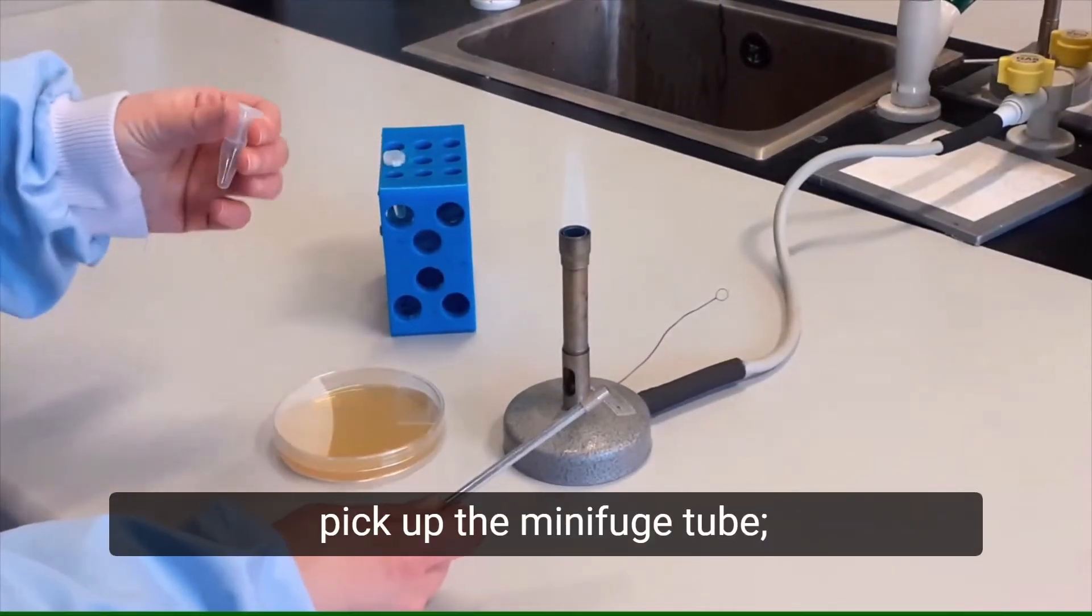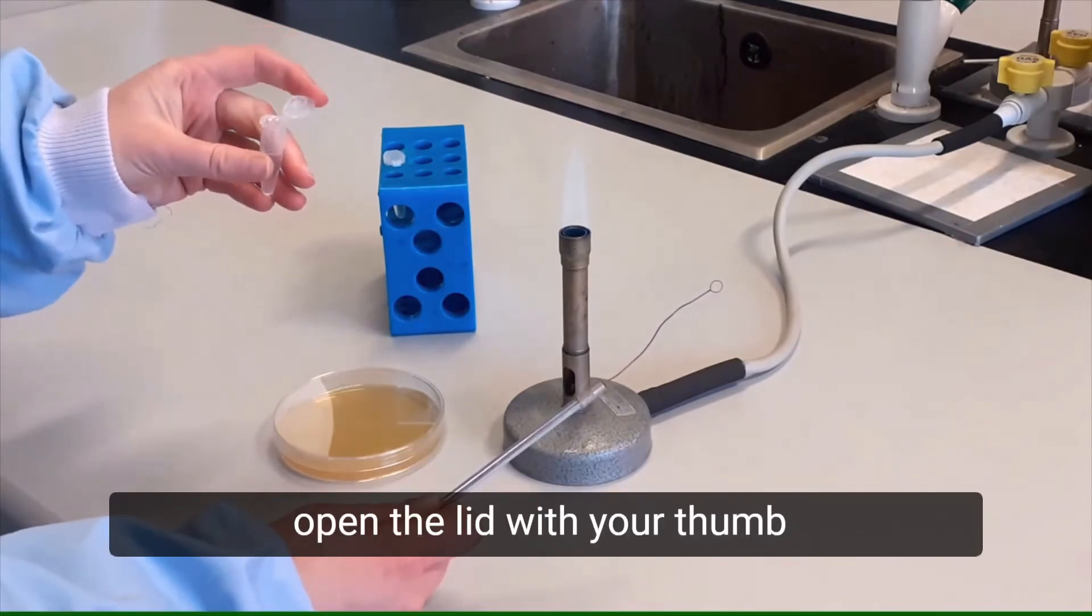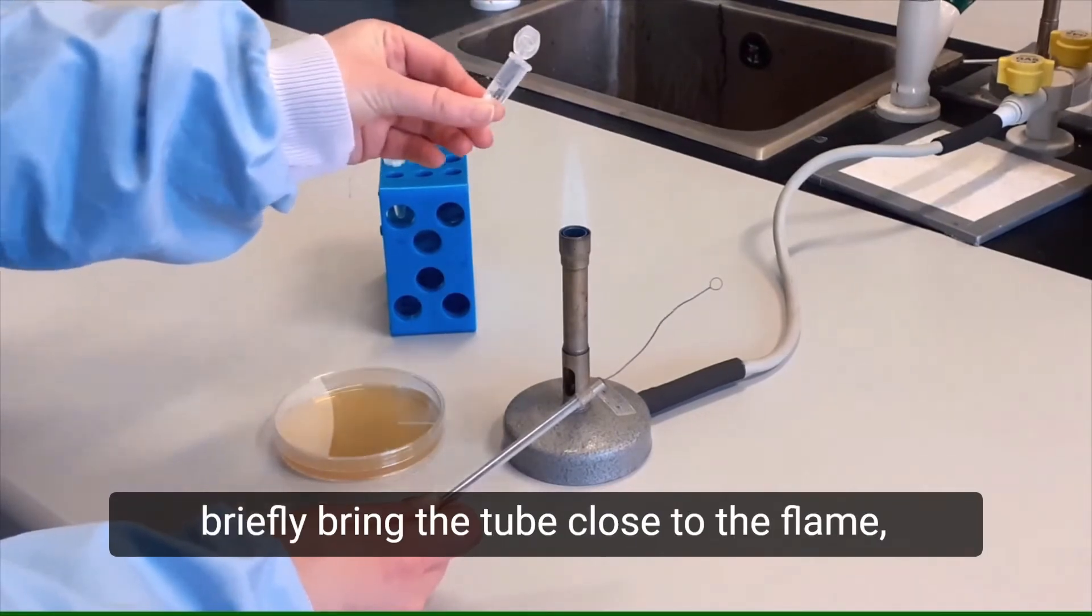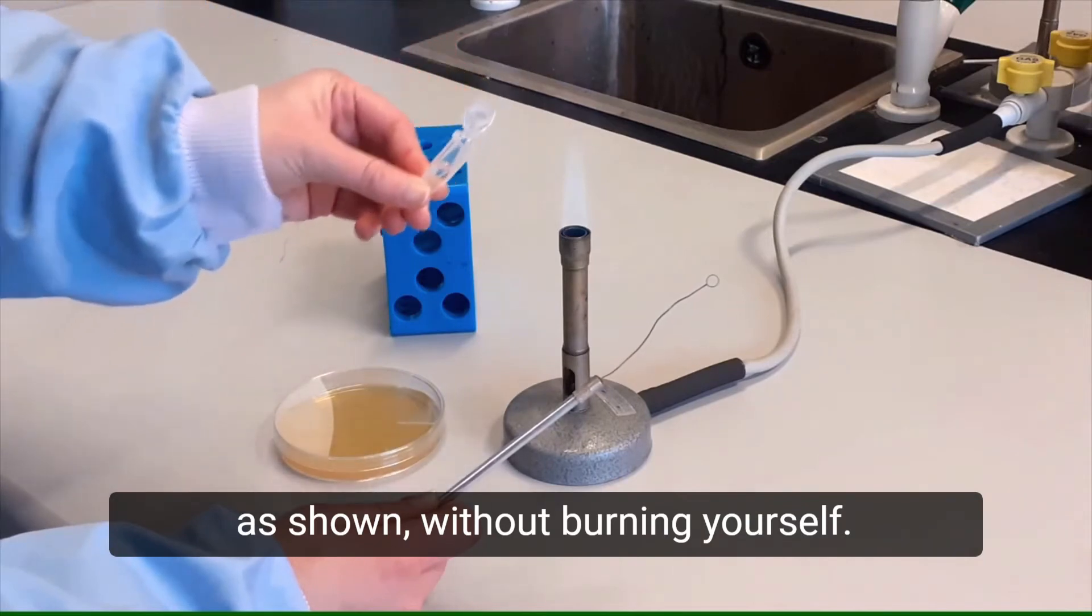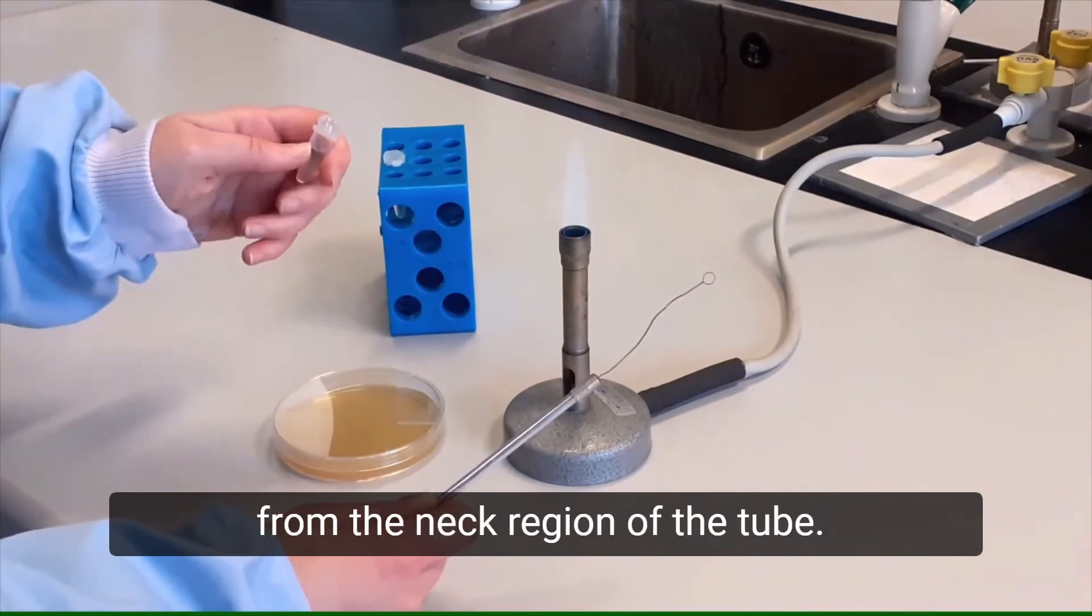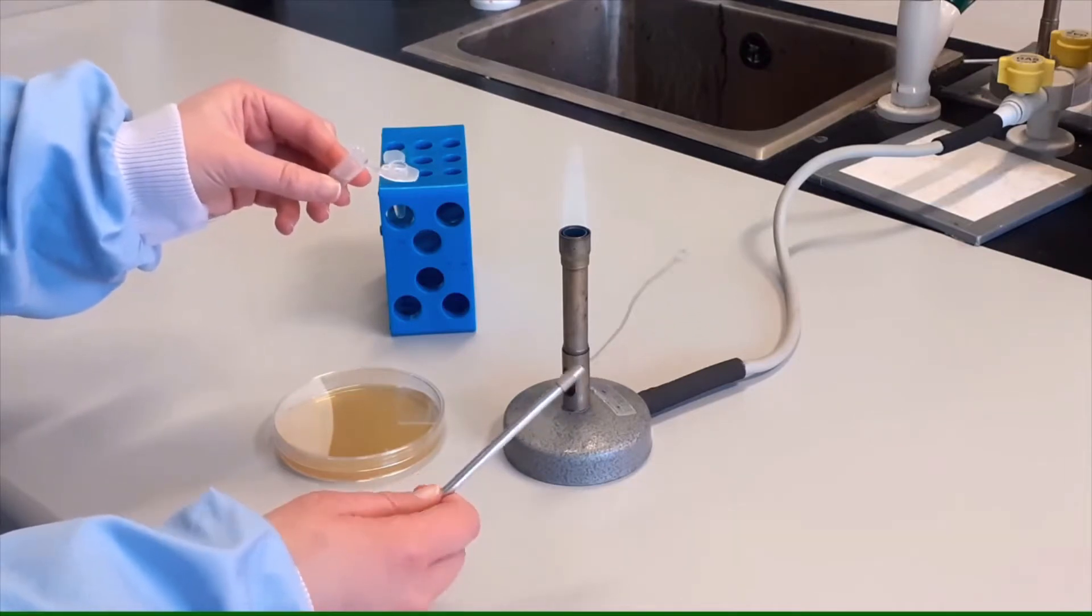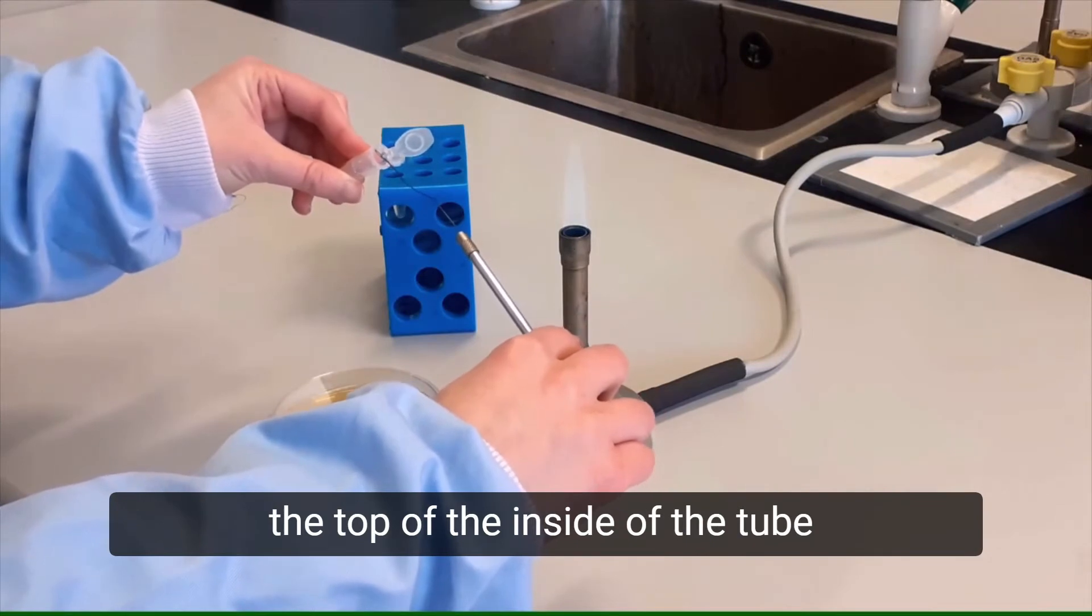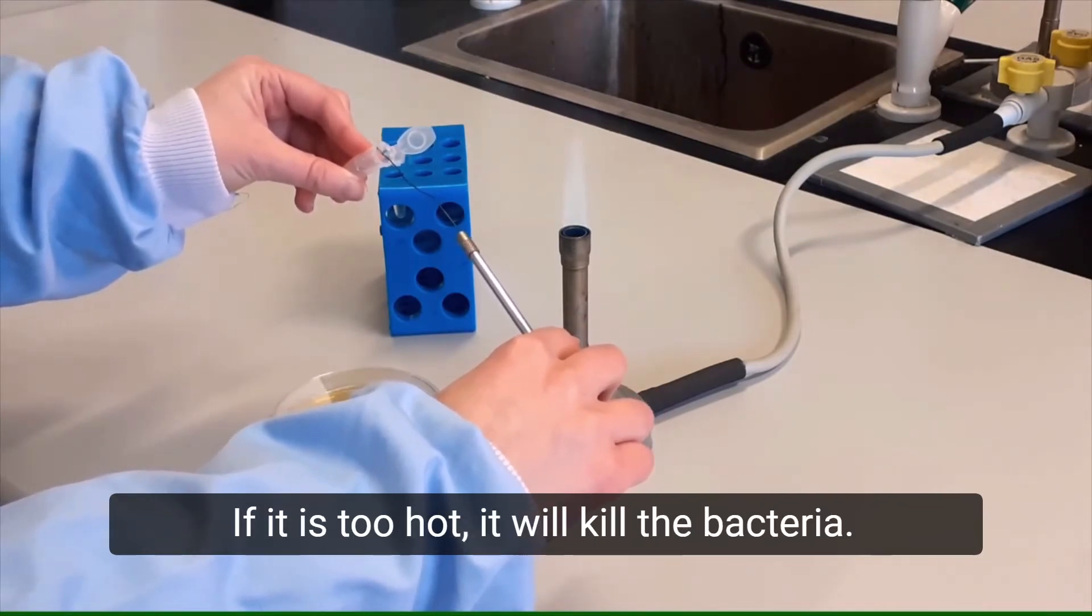With your other hand, pick up the Minifuge tube. Open the lid with your thumb and holding the tube at its base, briefly bring the tube close to the flame, as shown, without burning yourself. The updraft will remove contamination from the neck region of the tube. Do not allow the plastic to melt. Touch the wire loop against the top of the inside of the tube for a few seconds to cool it. If it is too hot, it will kill the bacteria.